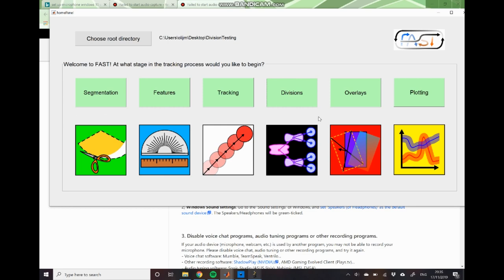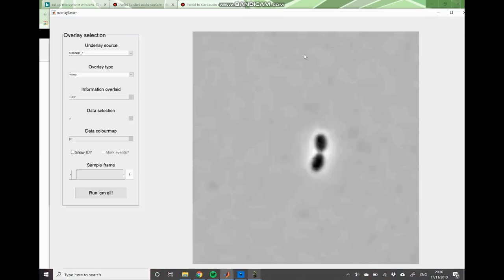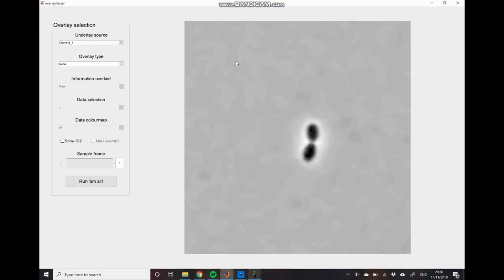And then just to make sure that we actually have performed our division detection accurately I'll give you a sneak preview of another part of FAST, the overlays module. And this allows you to overlay data that you've extracted in earlier stages of your original dataset.